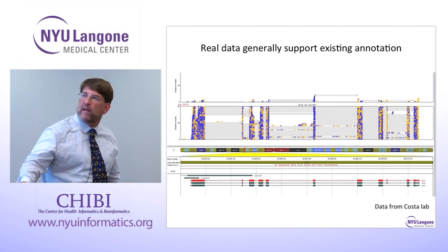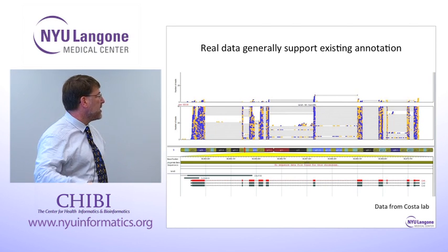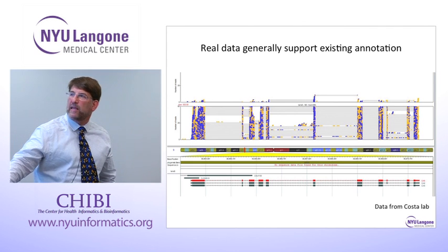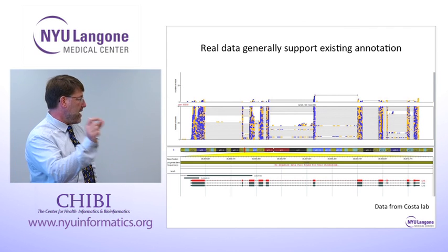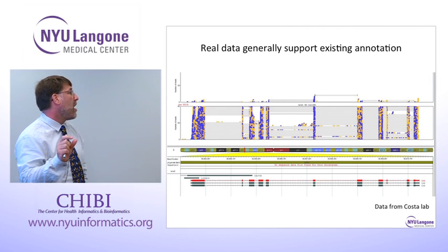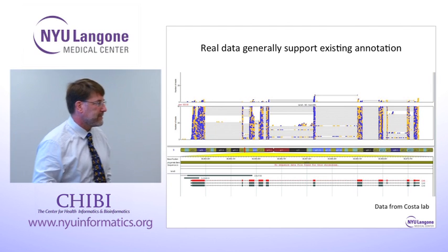So if you have a read here that's split with an upstream exon that's not annotated, then you're going to miss that. You may see a peak for reads that map entirely in that upstream exon if it's big enough. If it's small, if it's 22 bases, then it'll be missed entirely.